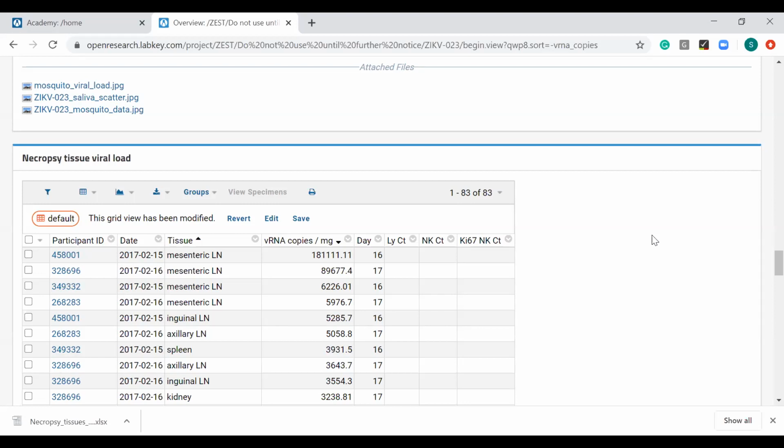Really, depending on the shape of your data, you could also use something called a lookup in LabKey. That is a graphical way to join data from different grids. It is true that one kind of data integration requires a participant ID and a time point column, but by no means do all forms of integration require that. That's just the classic study way of joining data. There are a lot of broader options for integrating data as well.